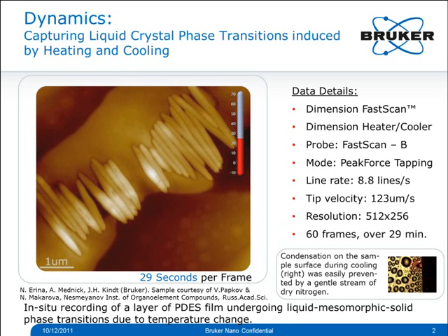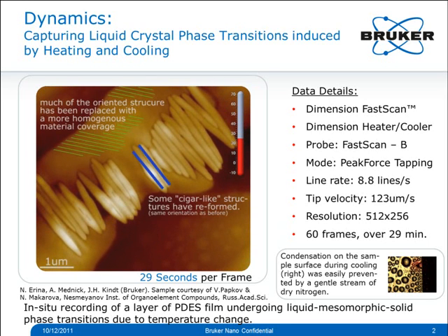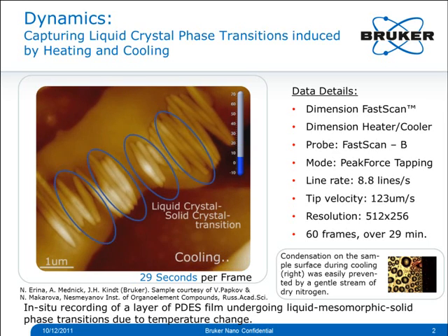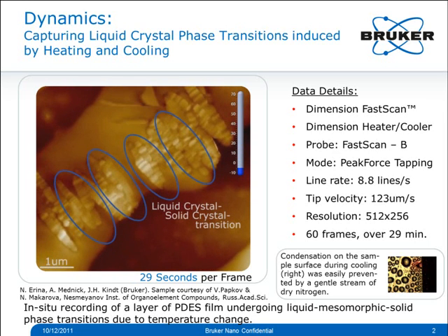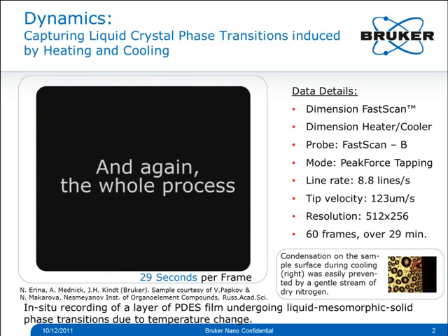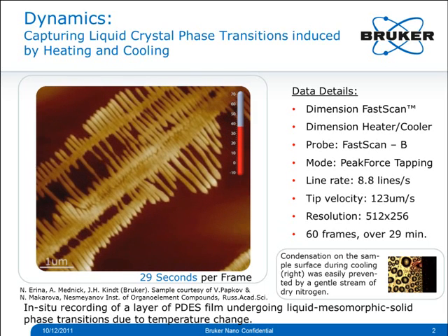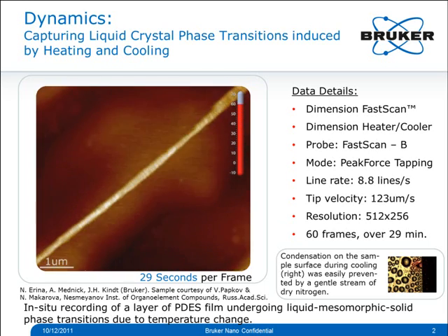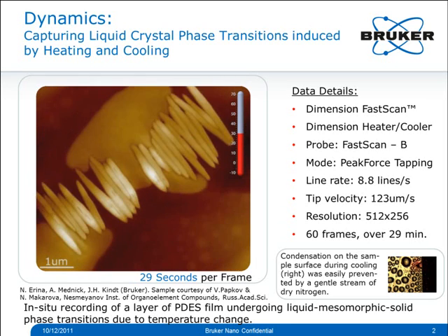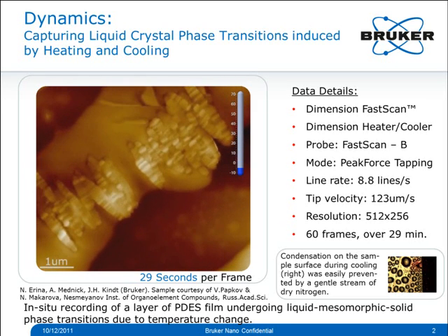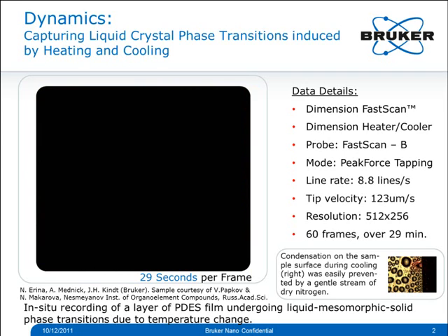Many of the seagull-like structures are reforming in the same orientation while a lot of the material is now non-oriented, as can be seen in the green marked area. Now we are cooling down and the seagull-like structures finally transition into a solid crystal. Let's watch the process again. Here we are heating — the seagull-like structures are melting. There must be some memory in there because the orientation of the seagull-like structures is the same afterwards, and here is the solid crystal.